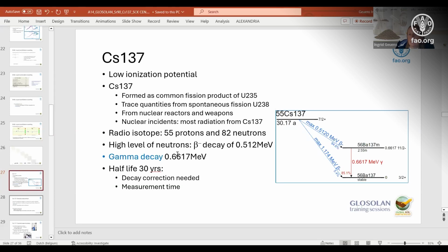Of course, like we do for the beta and alpha, we also have our protection of our clothes, but the clothes will not protect ourselves from the gamma rays because it's going completely through. But again, protecting ourselves so that we don't bring it on our clothes, and protect your hands, etc. And of course, the monitoring stays the same. We have to monitor the gamma rays that are coming from this source. But indeed, extra protection is needed for the Cesium-137.